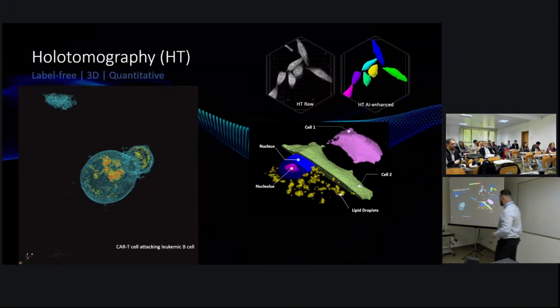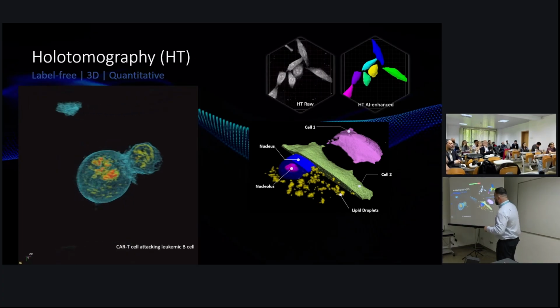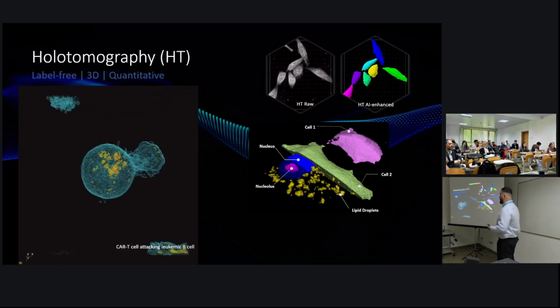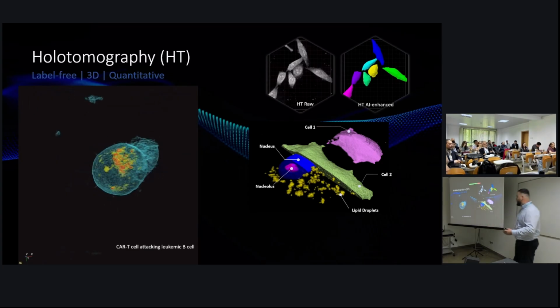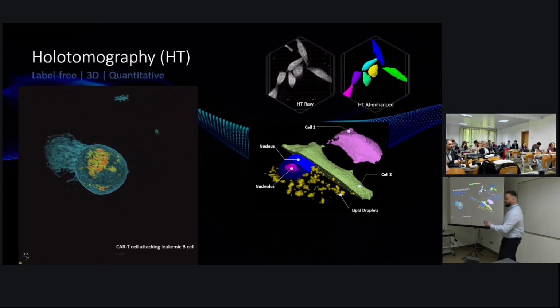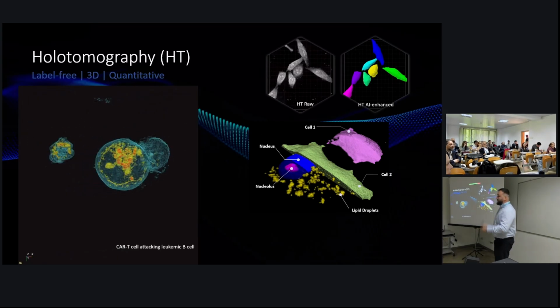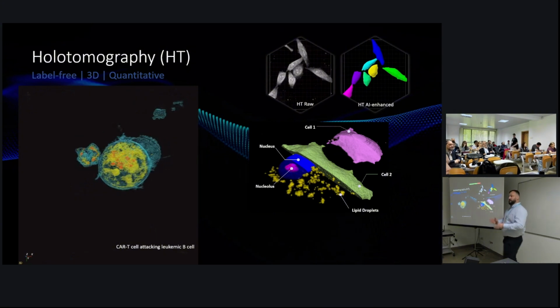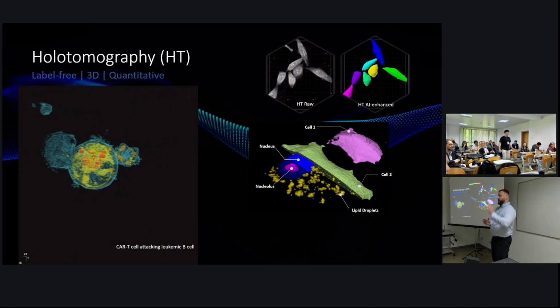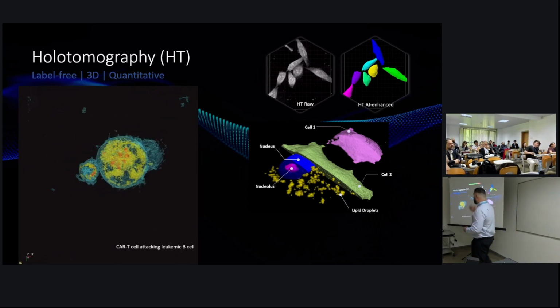So I want to show you just this video here on the left. If I were to ask you to guess what the colors are, probably one guess would be, oh, those are 3 different fluorophores that I'm using, like blue, yellow, and red, and so on. In fact, what you see in there is refractive index measurement thresholding. So basically, refractive index measurements in 3D, where you say from this number to this number is the blue, from that number is the yellow, and so on.